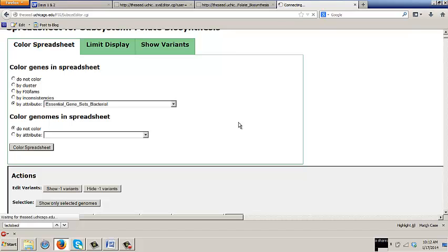It's much easier to get the information from here than to go into the individual essentiality studies, about three quarters of which are in this SEED. Yes, Veda? Yeah, and there's a few that are not. So we'll give it a little while longer. If it doesn't want to work, we'll leave it working and look at it later.